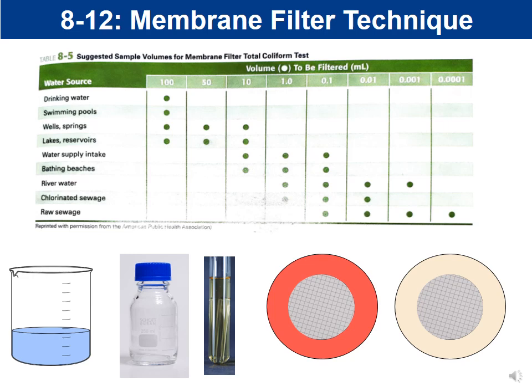Then there's actually going to be two parts to this that you're going to see. So one part, remember, I talked about that the membrane filter technique is presumptive. And that means that if we get a positive on the Endo agar, we can say with about 95% confidence that the organism is a coliform. But 95% is not 100%, right? And so you're going to see in a minute that we will also do what's called a confirmatory test.